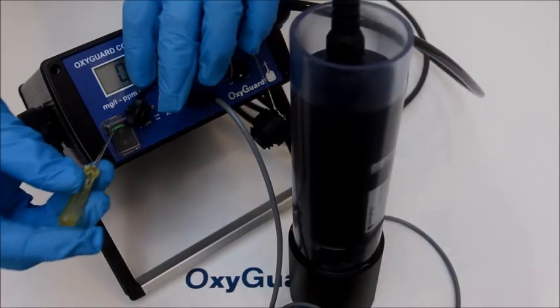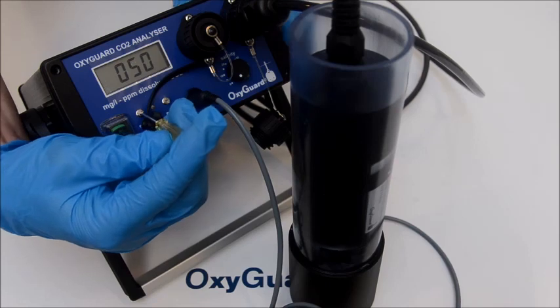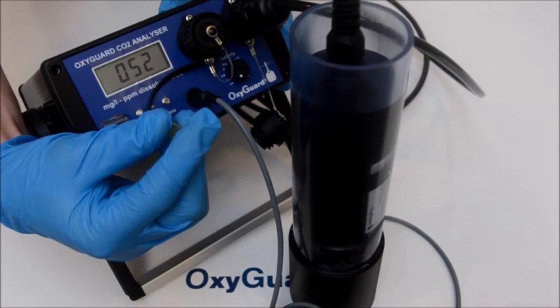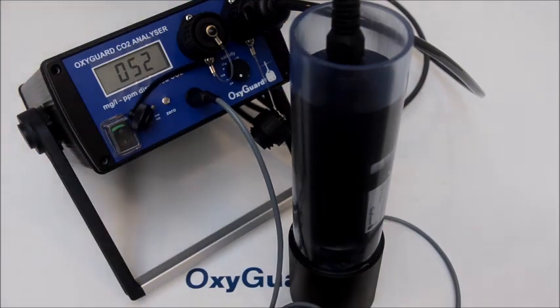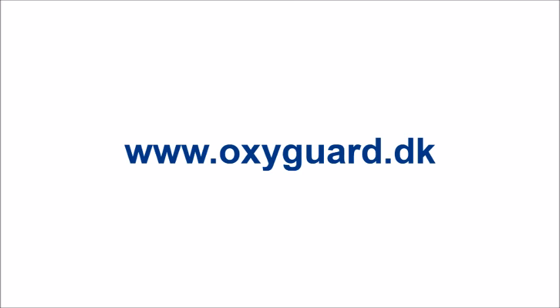I can now adjust the slope screw until the display shows the K value. Stop the stirrer, remove the probe, discard the water in the beaker, and rinse and dry the parts. Calibration is now completed.